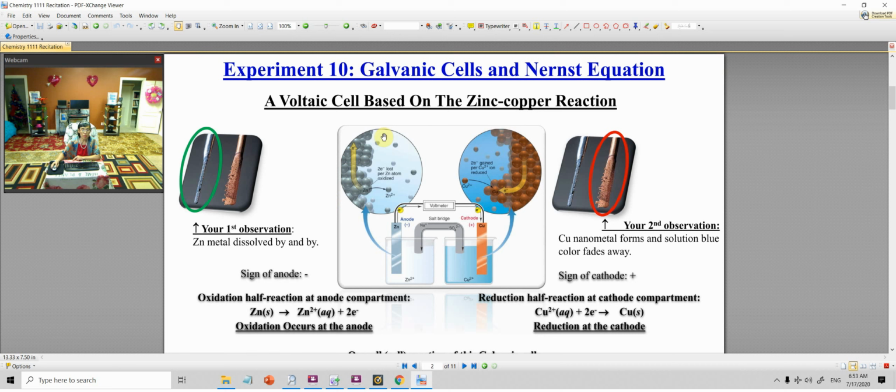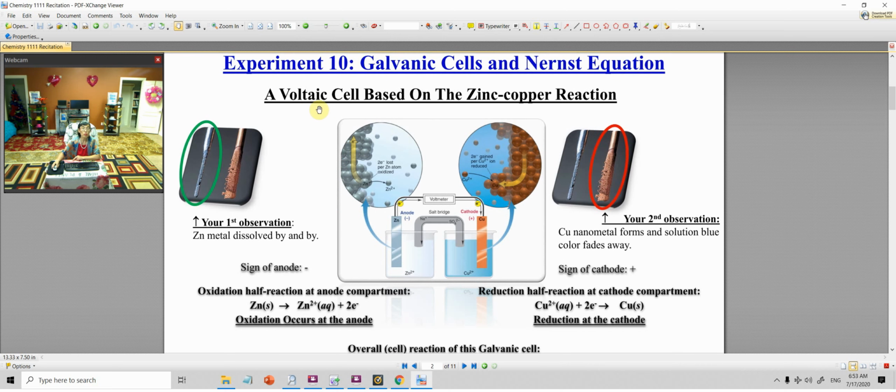The galvanic cell, lots of times people also call it a voltaic cell, meaning the cell has a spontaneous reaction involved. For example, I have this voltaic cell composed of a zinc nitrate solution or zinc chloride solution. You place a zinc electrode, and the other is a copper sulfate or copper nitrate solution, with a copper electrode. You hook up this zinc and copper, and you place a salt bridge in the middle, so you are going to form an electrical circuit.